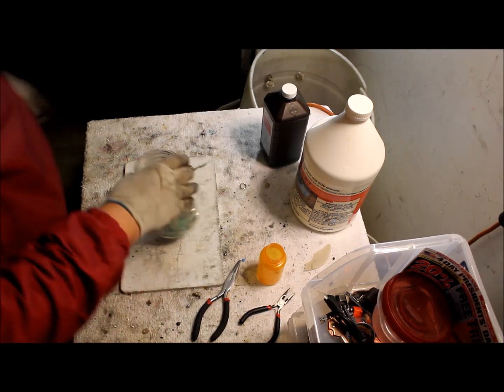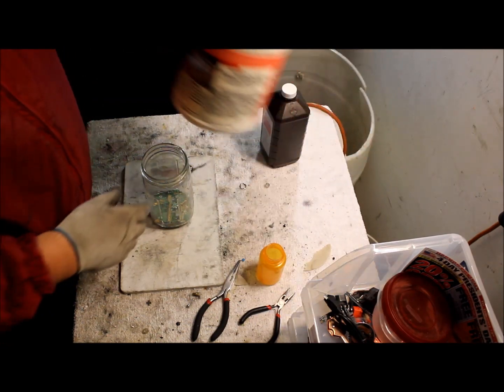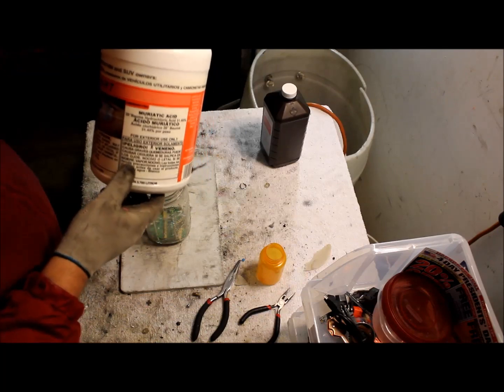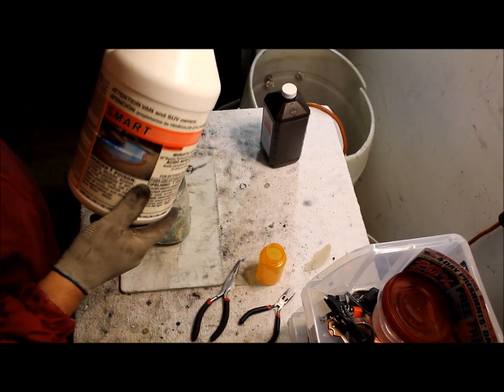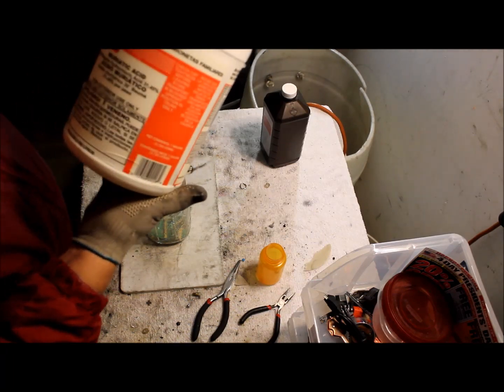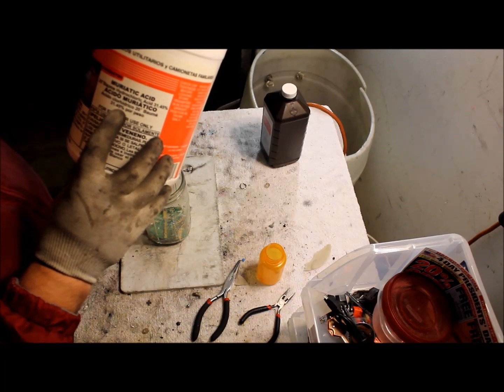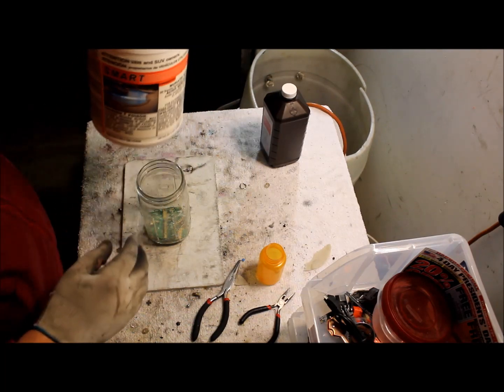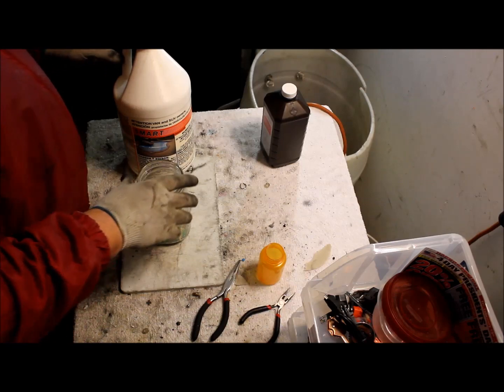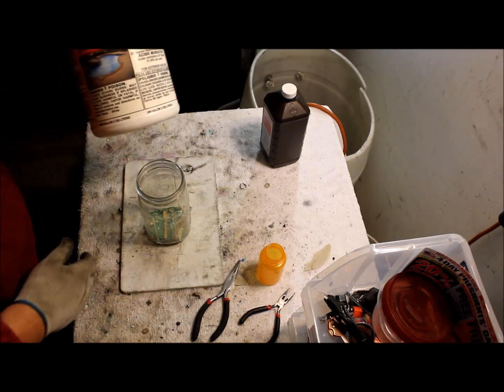What we're gonna do is fill it up with some muriatic acid. This one is 32% — well, 31.45%. I got this at Home Depot. You can probably get it at Lowe's too. Any hardware store should have some of this.